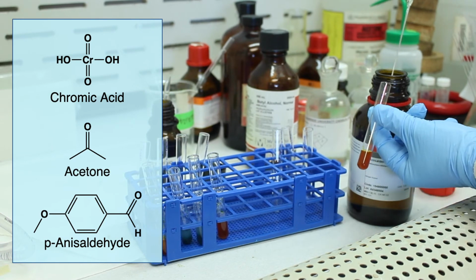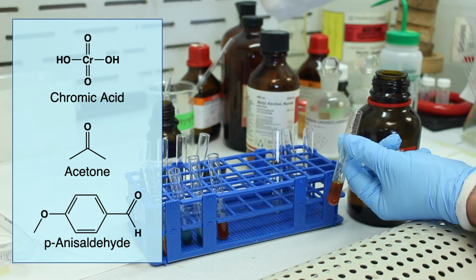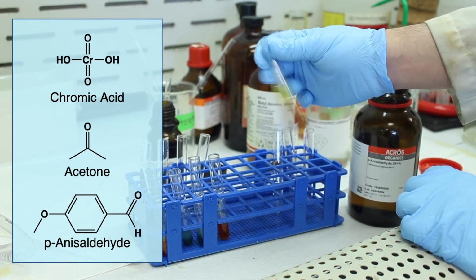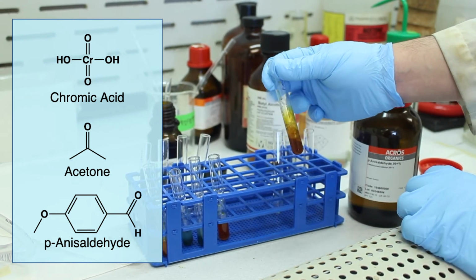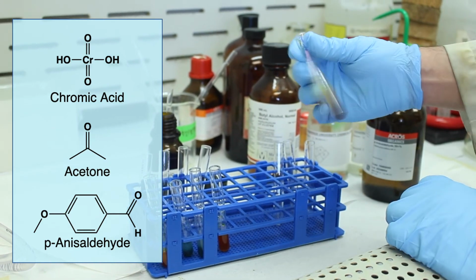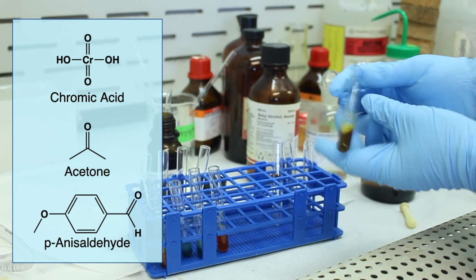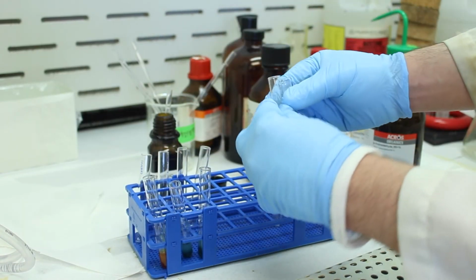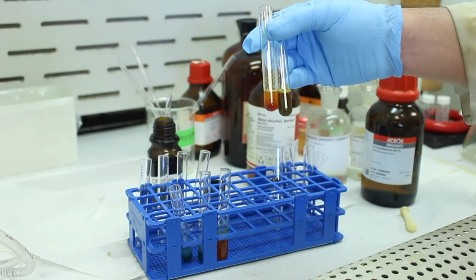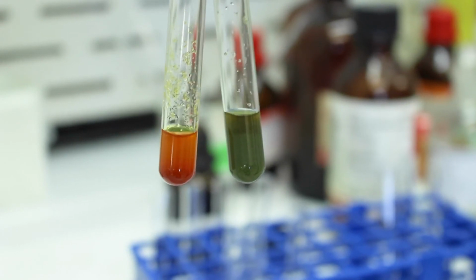Okay, so if we take some of the aldehyde, drop some in. These may react a little slower. Okay, it's a little difficult to see, but there is a hint of green to this solution compared to our negative result. Sorry, let's compare it to the control. Yeah, so you probably wouldn't be able to tell. If you just looked at that, it would be kind of hard to decipher if that's a positive or negative because it's not very blue.